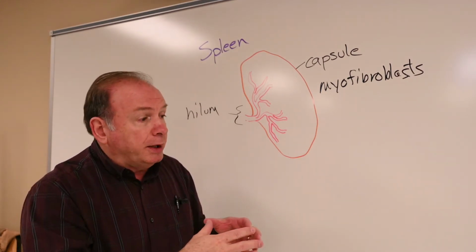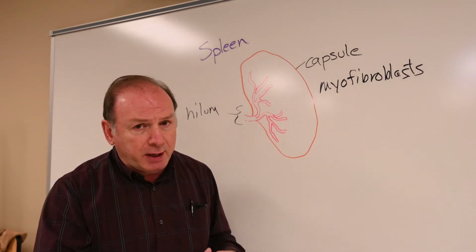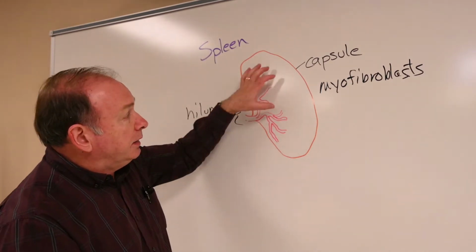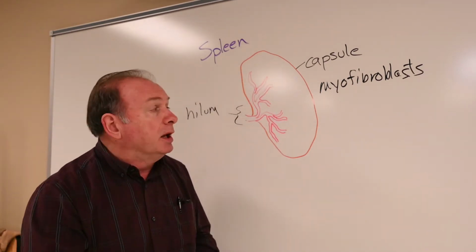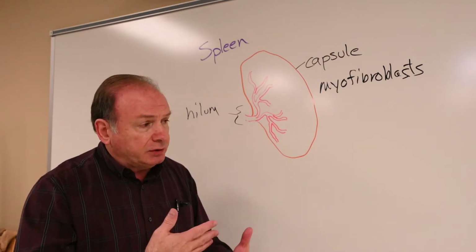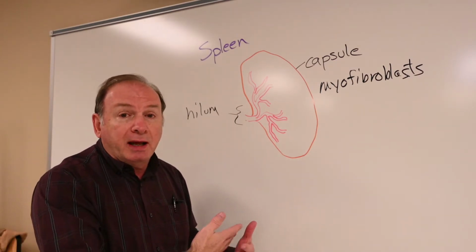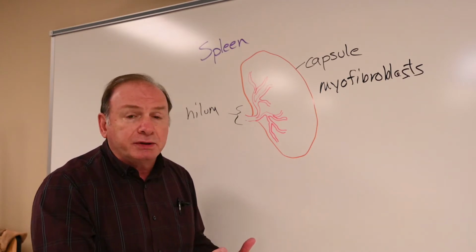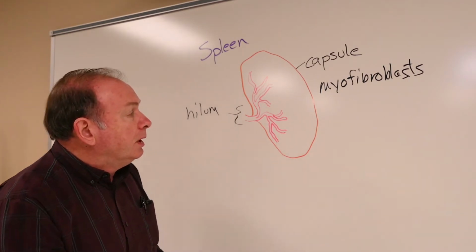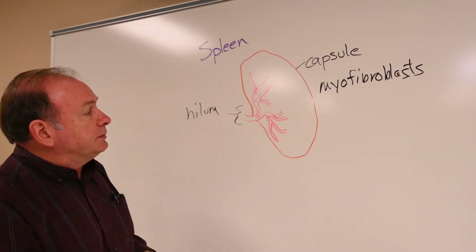The blood in the rest of the spleen makes up what we call the red pulp, or contributes to the color of red pulp. So the white pulp and red pulp make up this here, and it looks kind of marbled or mottled throughout that if you look at a fresh cut piece of spleen. In our microscope slides, the white pulp, with all of its lymphocytes, will stain a dark blue purple color, and then the red pulp will still have more red blood cells in it, so it'll stay the pink color of the red blood cells a little bit more than what you see in the white pulp. So our white pulp is going to be blue and our red pulp is still going to be red in our microscope slides.